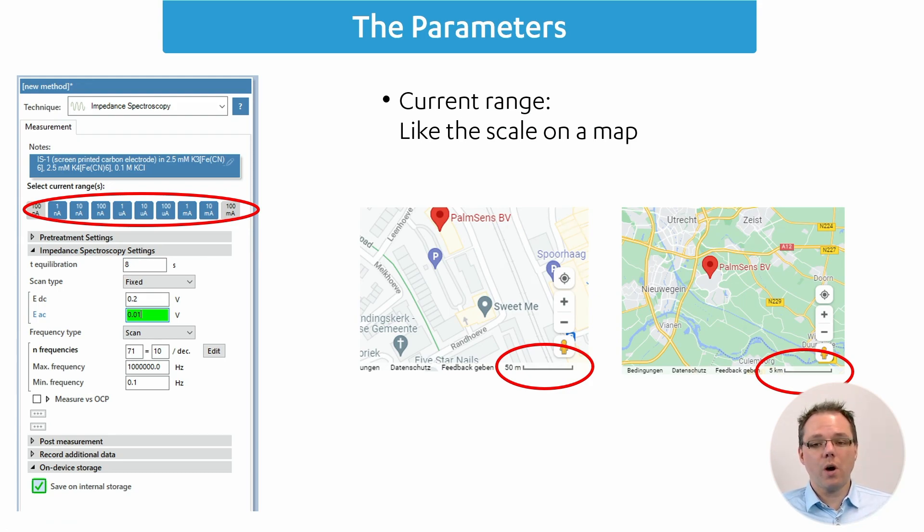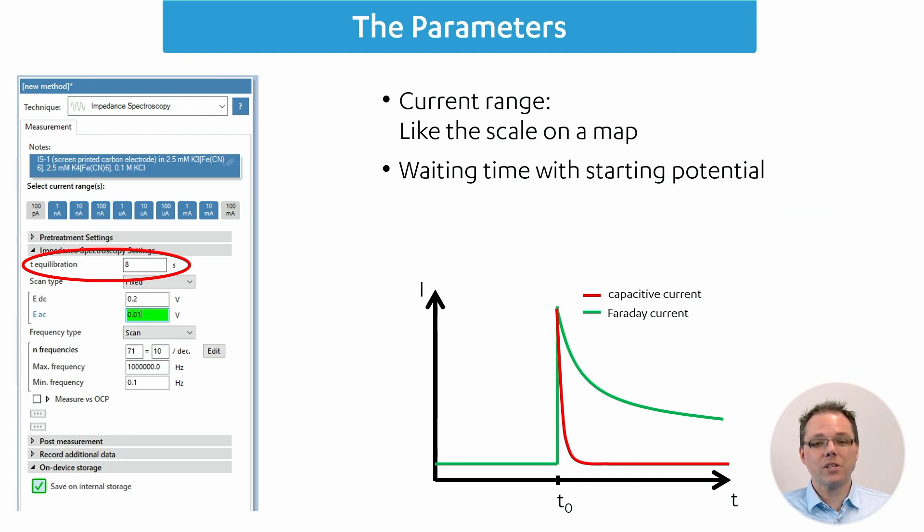And this is how your current ranges work. If you put too high a current range, your resolution for low currents will get worse. And if you put too low a current range, you will cut off higher currents because you cannot measure them anymore.